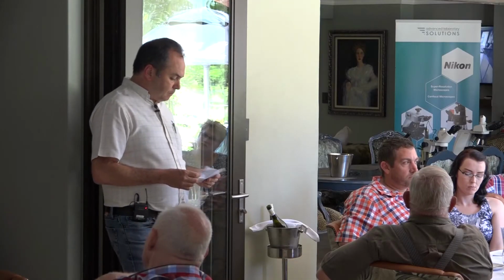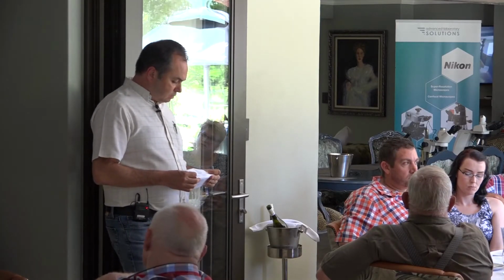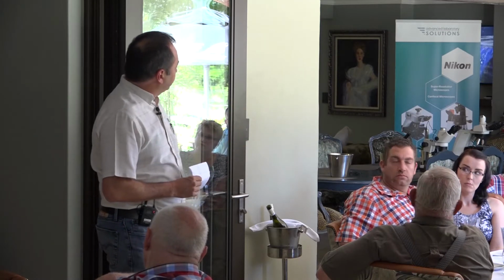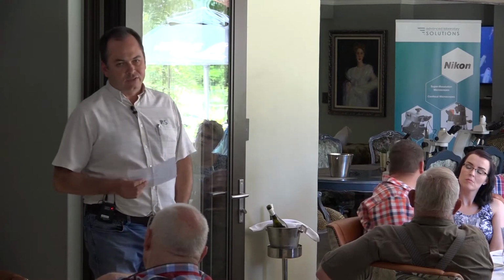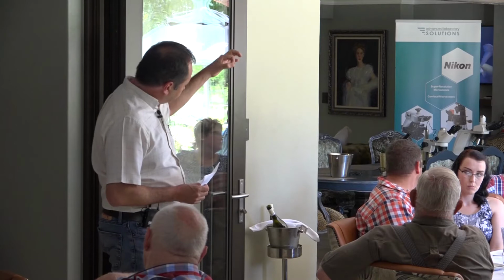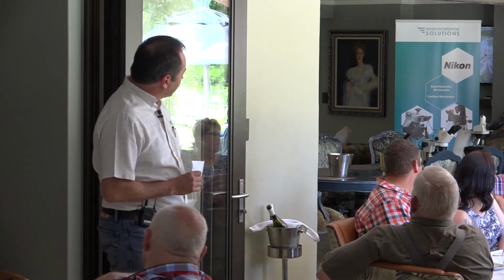So what I've thought would be good to talk about is the three microscopes that I've brought here, just to give you an idea of the price difference in microscopes. The one that is closest to me on this side, with a single eyepiece, a monocular, sells for about 2,500 Rand. The one on the far end is actually a middle of the range microscope. It sells for about 100,000 Rand.